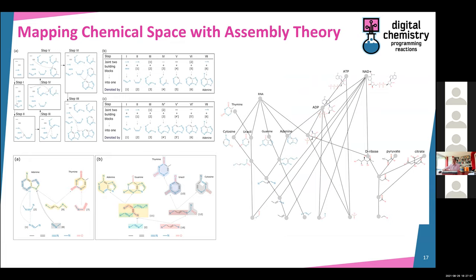We've basically got an idea for looking at how complex a molecule is. So the most important point now is to say, okay, we have a way, an assembly detector, to find complex molecules. What about looking at different reactions, looking at information in reactions? So I wonder if we could use assembly theory to not only look for aliens, but to design drugs and to design new types of avenues for making molecules.